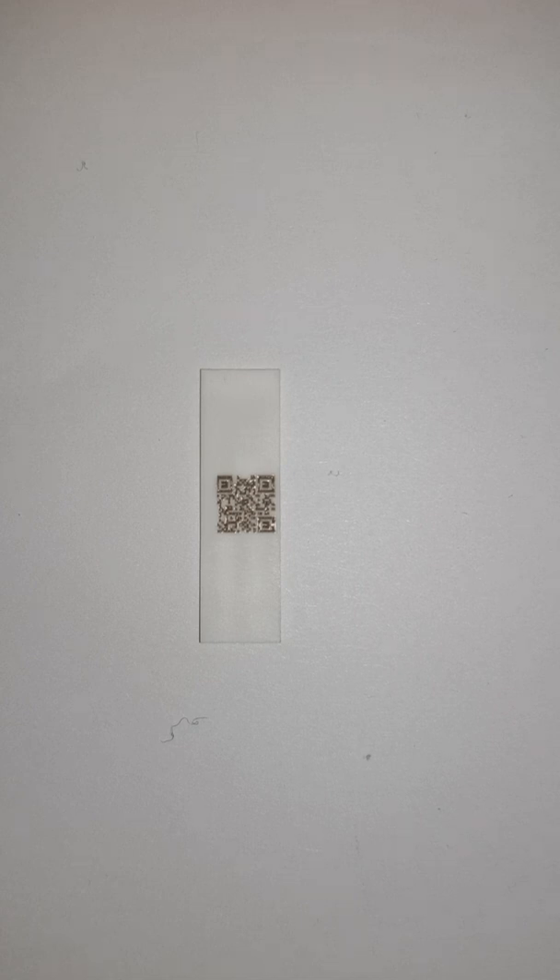So if you are looking for the ultimate traceability behind your sensor or your screen-printed electrode, please talk to us at Seamron Peacock. As you can see, we are quite able to put QR codes on the back side of the sensors. So if you have a sensor and want to know the history of the sensor or something about the manufacturing of it, a little QR code and a smartphone will give you access to that kind of information.